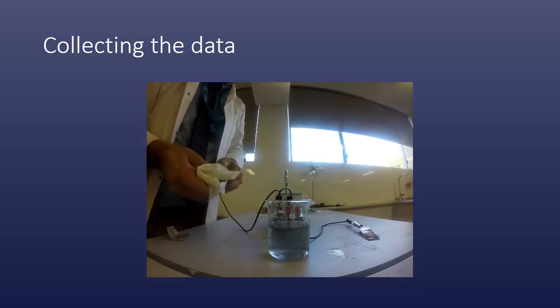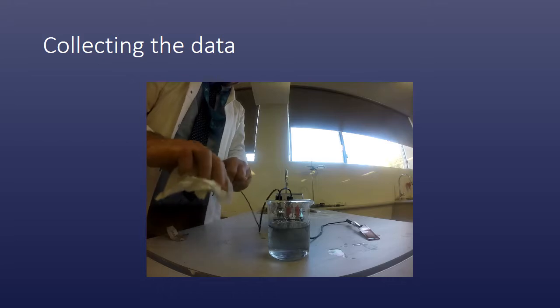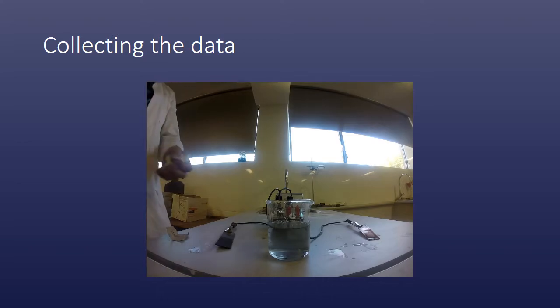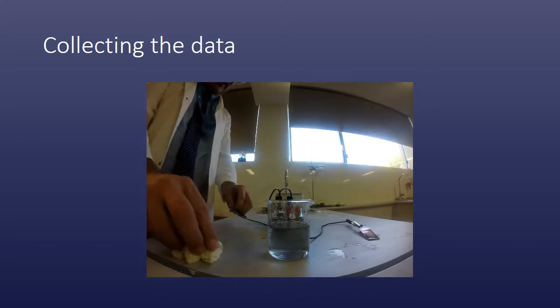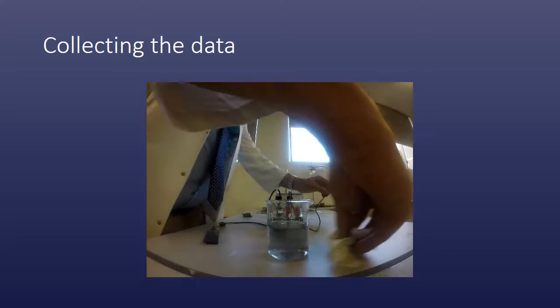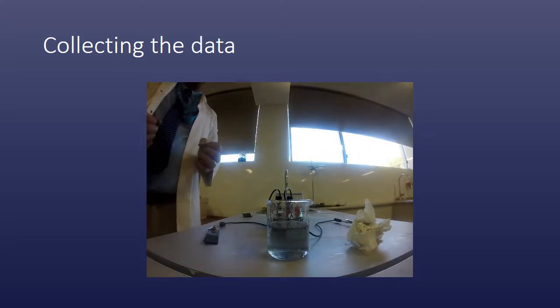It's the hydrogen ions in the sulfuric acid that are actually being displaced by the more reactive zinc. So when the hydrogen is displaced from the solution, it produces hydrogen gas. That's where all those bubbles are coming from. It is a reaction which is enabling electrons to move, and so therefore I'm completing the circuit, but I'm using a slightly different combination of chemicals this time for my galvanic cell.